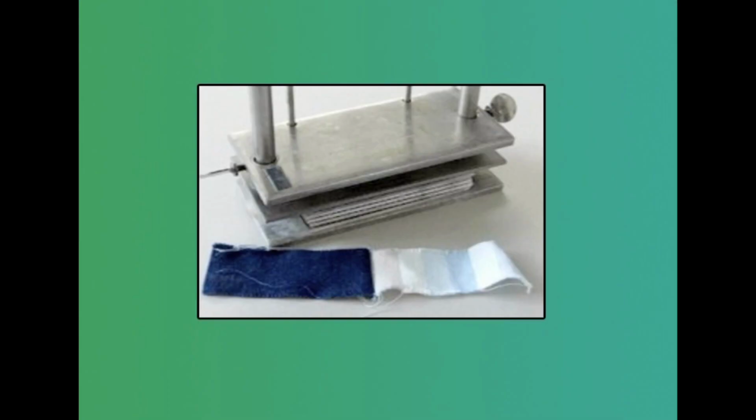Afterwards, the stitches are removed on the 2 longitudinal sides and 1 short side. On 3 sides the stitches are removed, and on 1 short side the stitches remain, and later the sample is dried at normal temperature not exceeding 60 degrees centigrade, and later the sample is tested using the grayscale standards. These are the common standards developed which indicate the color change that has happened in the dyed material and the color stain that happens in the white fabrics adjacent to the test specimen. So, this is how the color fastness to washing is done.